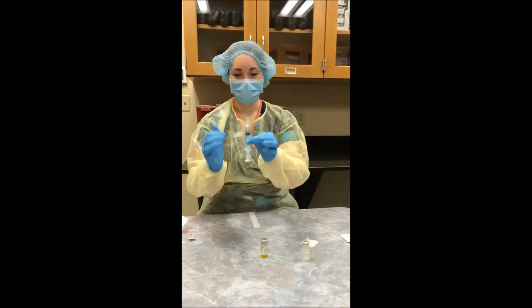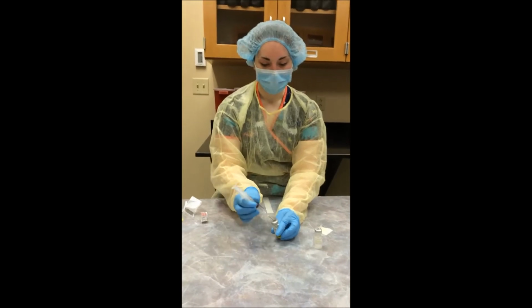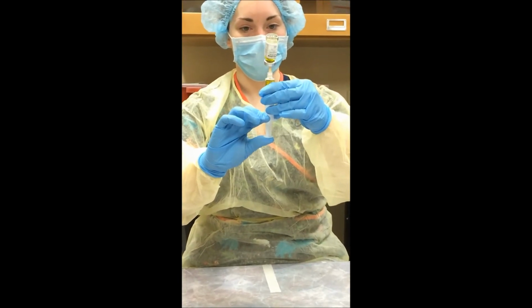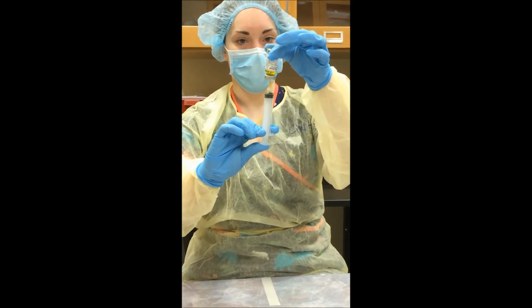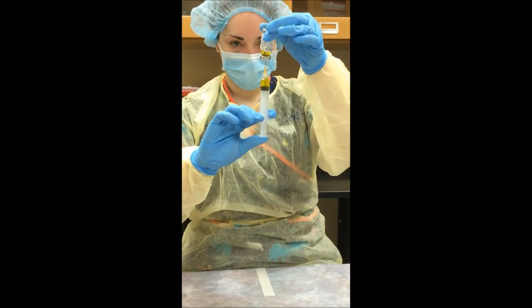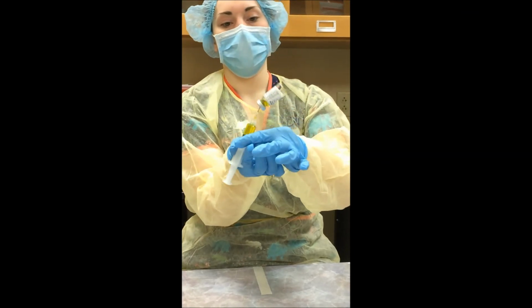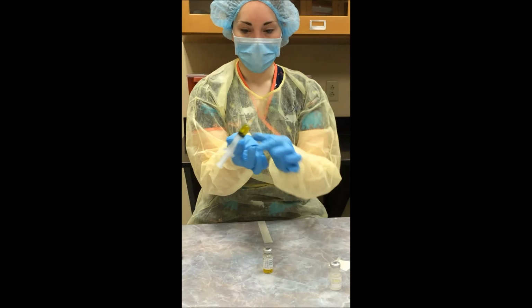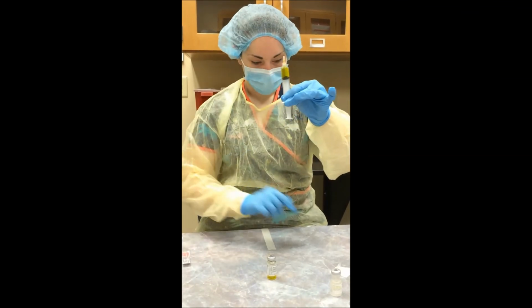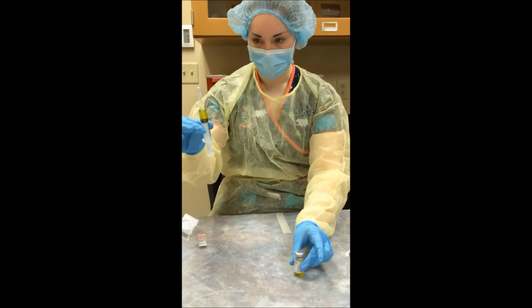All right, now after putting in the desired air that you want to draw up, you would go in, draw, 45-degree dart method, flip it up. Right, so then you have your desired quantity. Get rid of your air bubbles. And you take your cap, put that on there, and for this syringe we are all set.